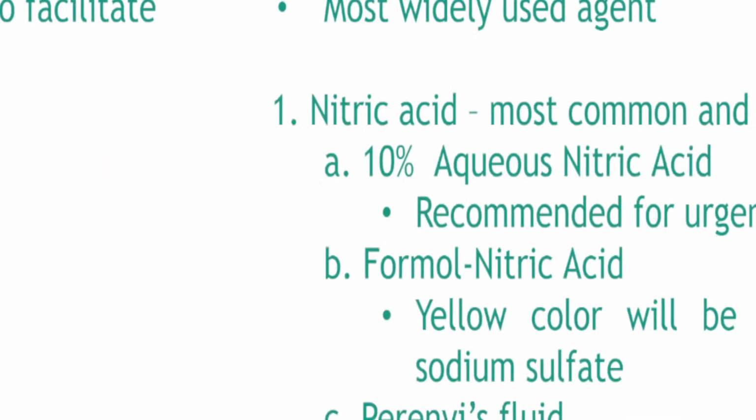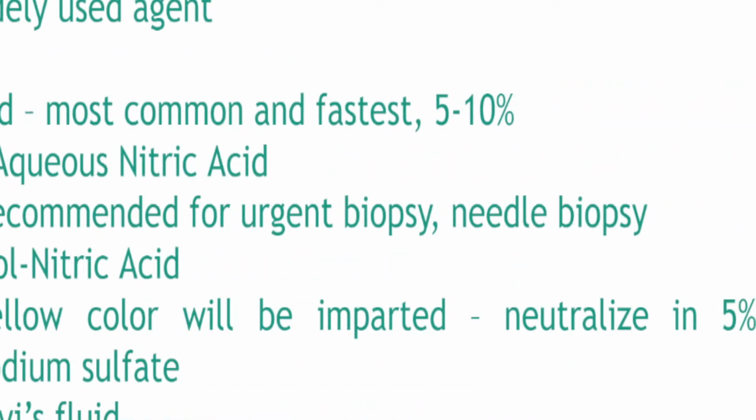Let's move on. Okay, so decalcifying agents. Let's talk about decalcifying agents. The most common and the fastest is nitric acid.